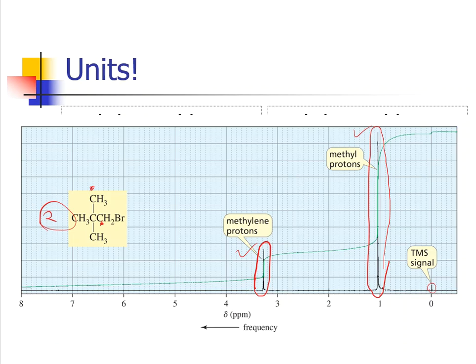All right, so at this point, we have talked about the basics of NMR as far as being able to look at an organic structure and determine the number of signals that actually come from that organic structure that would be represented on an NMR spectra. And we're going to take this another step further eventually, but there's still some terminology that we're going to have to take care of before we go into that next step. And we're going to start tying all of these loose end pieces together finally.